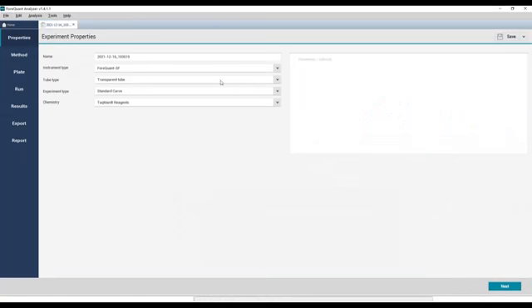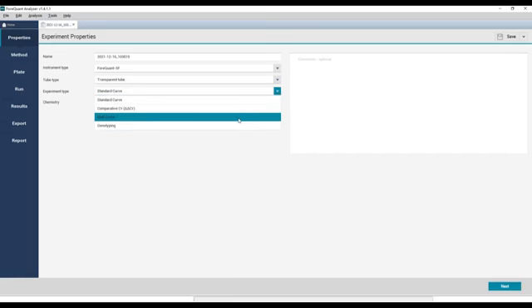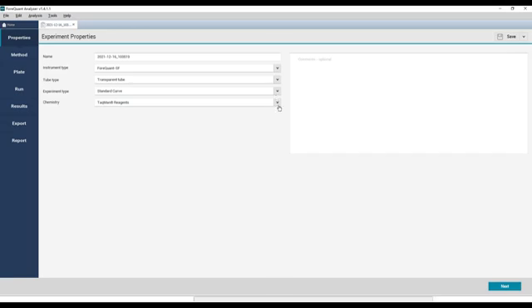A new experiment setup process is as follows. Experiment property setting. Experiment name: the default is the current time, which can be customized. Tube type: transparent tube is the only option. Type of experiment, including standard curve, comparative CT, double delta CT, genotyping. Here we take SARS-CoV-2 detection as an example for the following instruction. It can be done with the experiment type of standard curve, thus standard curve is selected here.